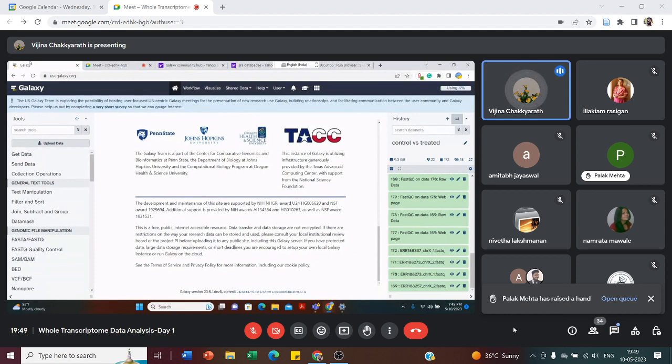Paired end sequencing means both ends of the DNA fragments are sequenced. This means that the instrument reads two sequences from each DNA fragment, one from each end. Paired end sequencing is useful for applications that require higher sequence depth, longer read length, and more accurate assembly of complex genomes or transcriptomes. So usually for transcriptome analysis, we prefer paired end data.